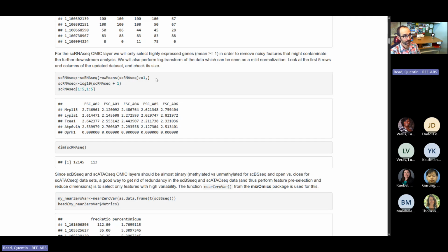And we're also going to do a log transformation on the data set because we want to look at variation in expression on a log scale. It varies by orders of magnitude, and it's these multiplicative differences in expression that matter. It also makes the data behave better because it has a more normal distribution at that point, which can work better for some of these analyses. So that's what these two things are doing.